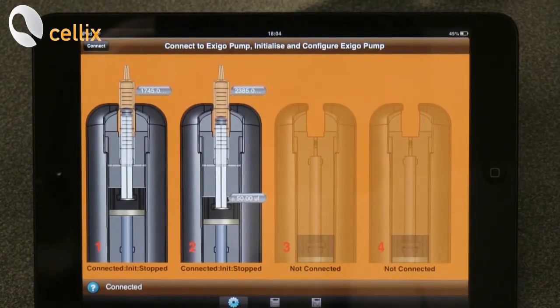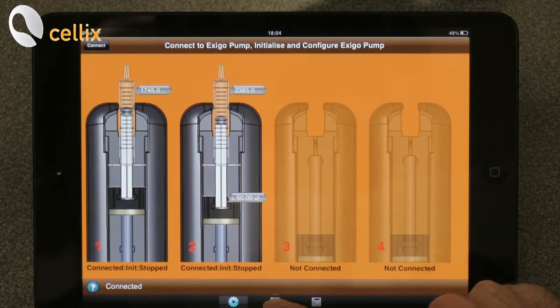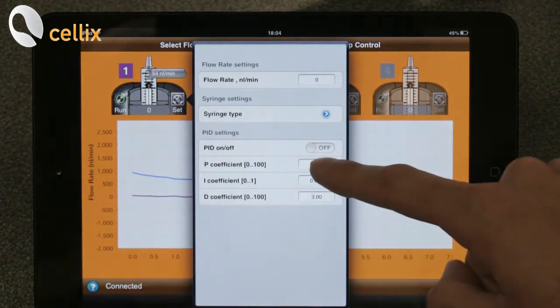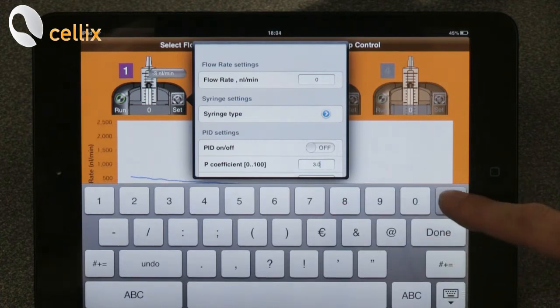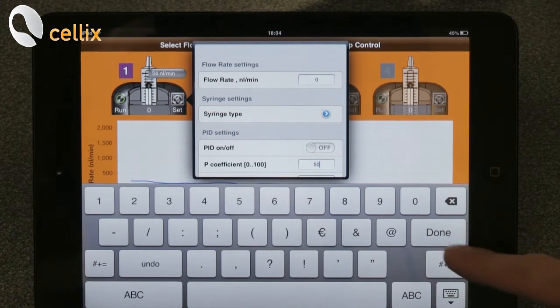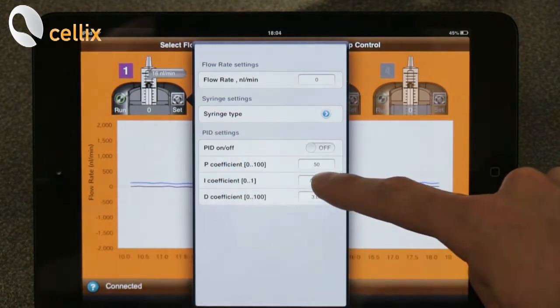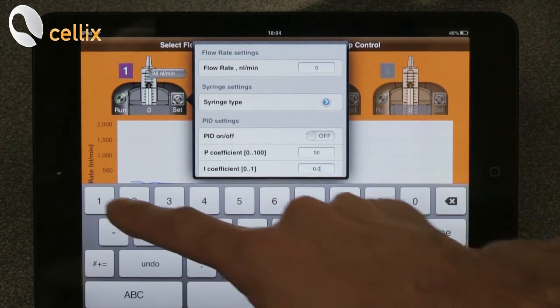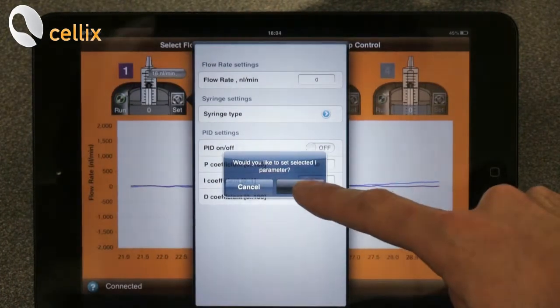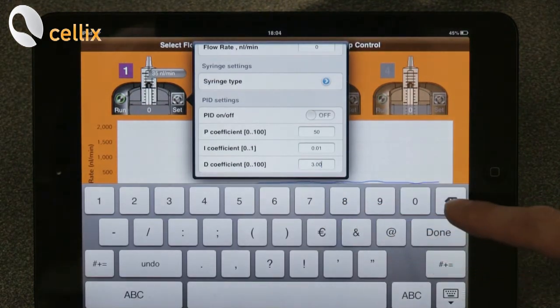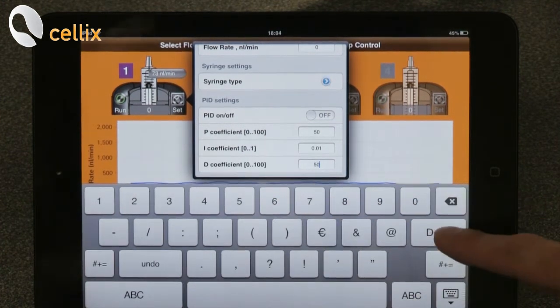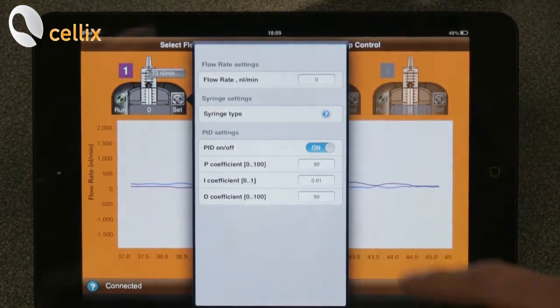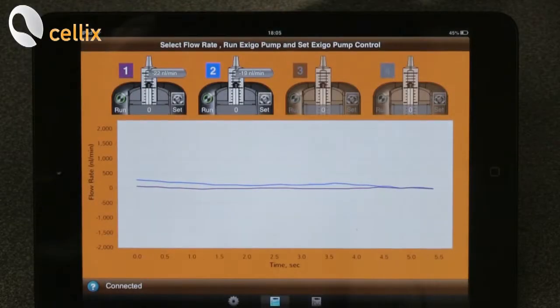We can proceed now with the settings of the PID. So just click on run and then set. Just change these values to 50 for the P coefficient. And then we can turn it on. And then again 0.01 and 50 for the I coefficient. And then we can turn it on. Similar operation can be done also for the second pump.